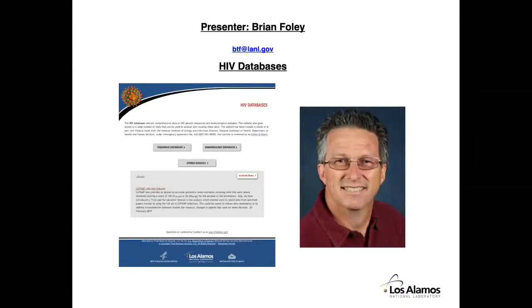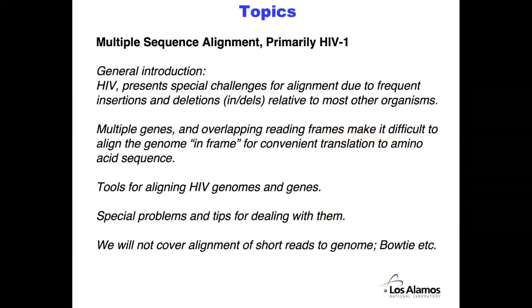Today I'm going to be covering multiple sequence alignment, really focusing on HIV-1, which has some interesting properties, and we also have some tools for it. I'm mostly going to be covering our gene cutter tool, but also talking about other tips and tricks.